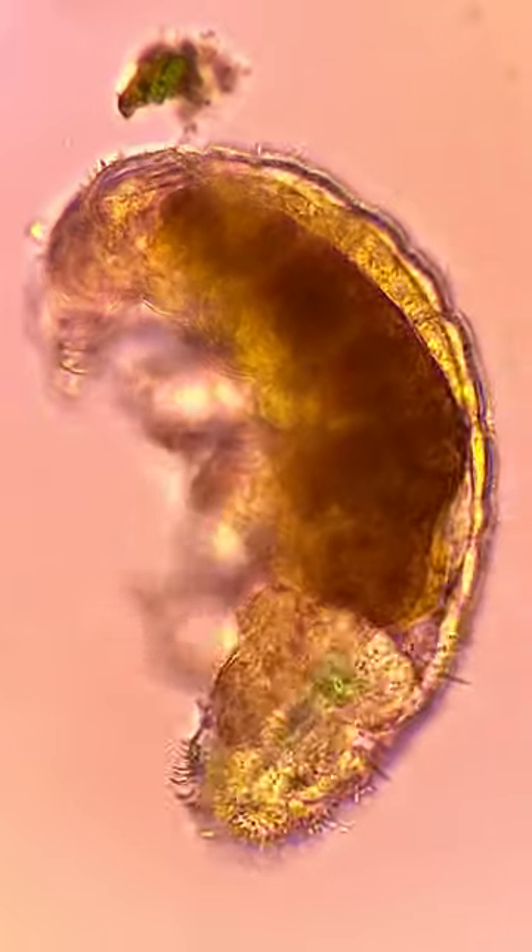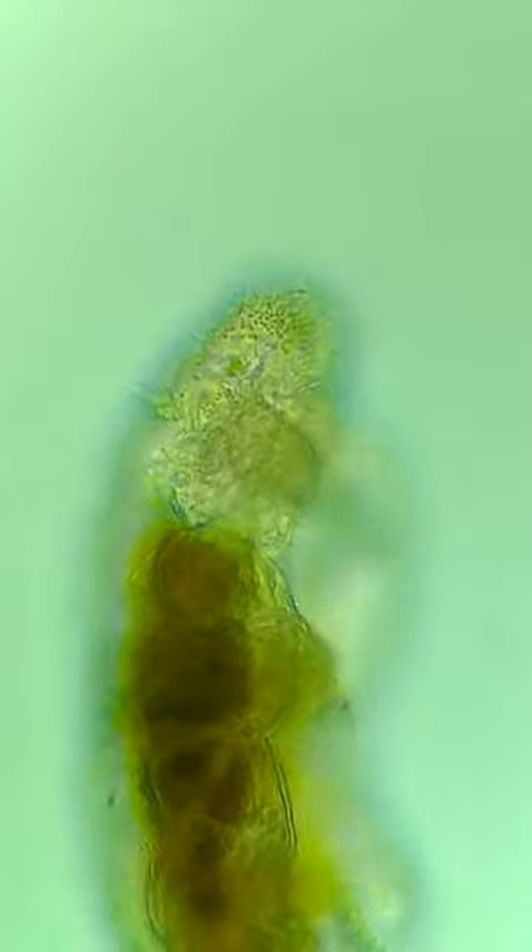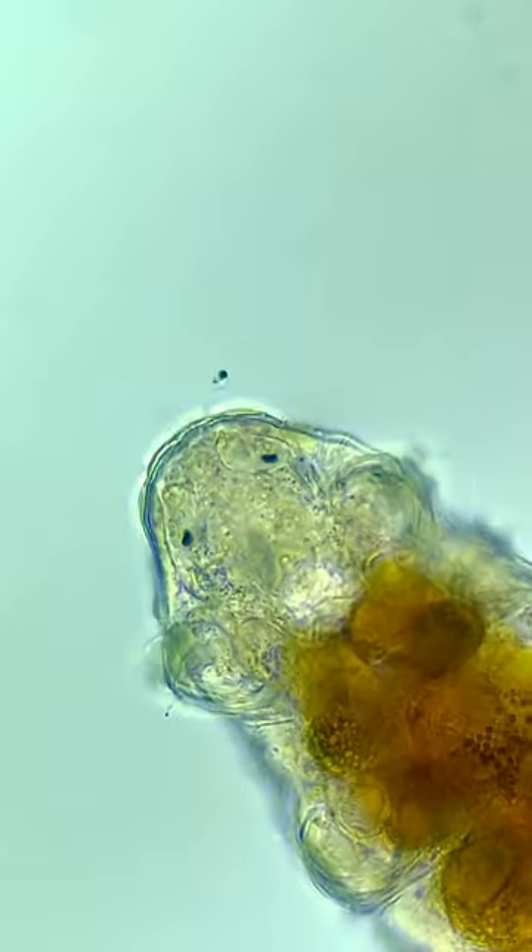Weirdly enough, it only has 8 claws on the back two legs. How amazing is this creature? What should I look at next?